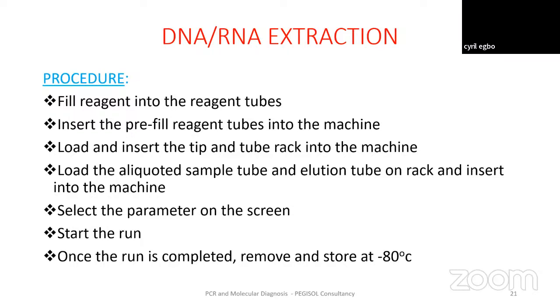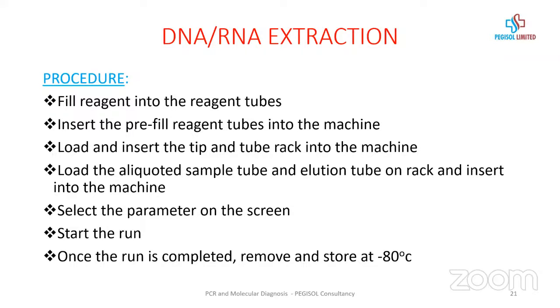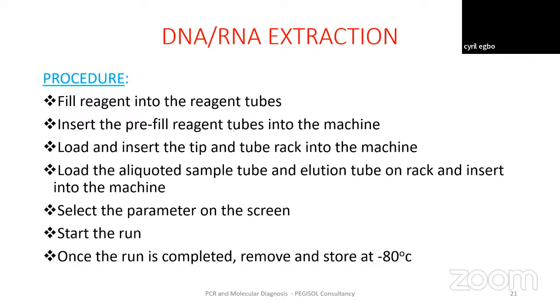So then what you need to do is just like the conventional automated machines that we have, for instance, chemistry machines. We have semi-automated machines for chemistry and we have fully automated machines. Like some of these automated machines for extraction, they are fully automated machines.